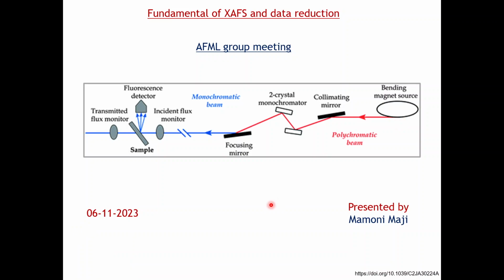Good evening everyone. Today I will be presenting the fundamentals of XAS and how to process the data in the software. Here is the schematic view of how the measurement is done.